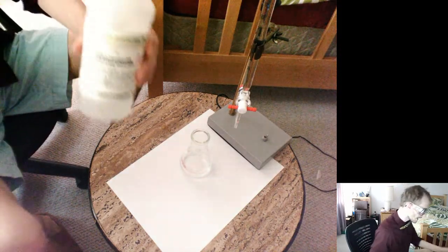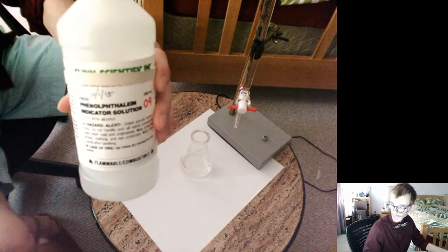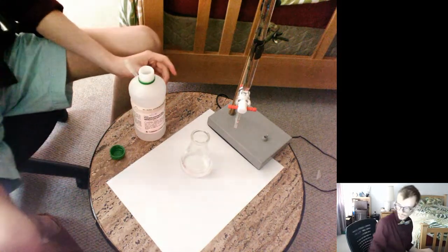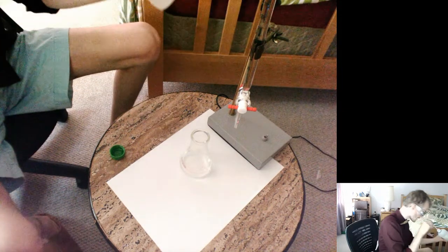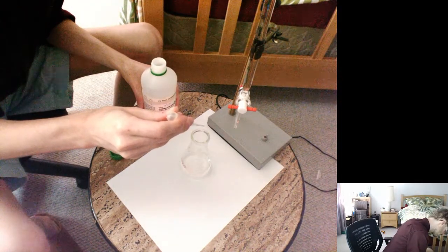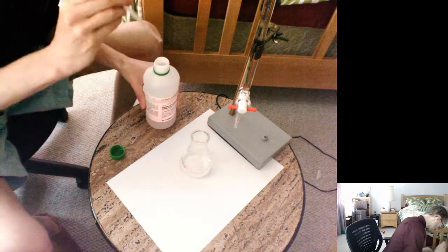Okay, so here I have my phenolphthalein indicator. So if you watch the notes, you know that I need to add a couple of drops of this to my acid so that I'll know when this thing turns into a base. Something else I wanted to do was maybe show that this was an acid by using a pH strip. But I'll start just by getting some phenolphthalein. Just going to add 1, 2, 3 drops in there, maybe 4. And that is all I need.